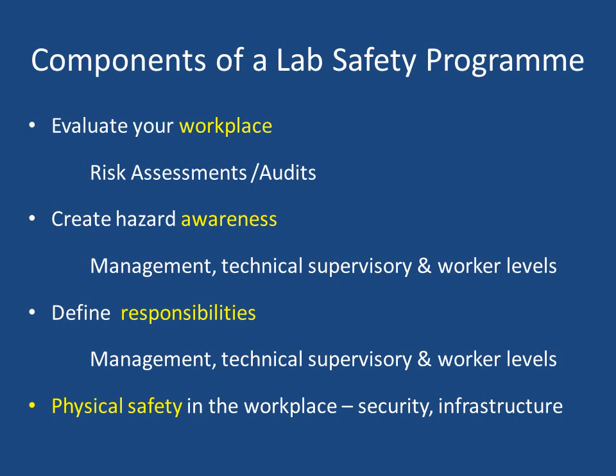Physical safety in the workplace. You need to consider how secure is the workplace, especially for women staff at night? How safe are the premises? Is security provided by the administration? Is entry into the laboratory restricted? These are the hazard awareness that you need to look into.